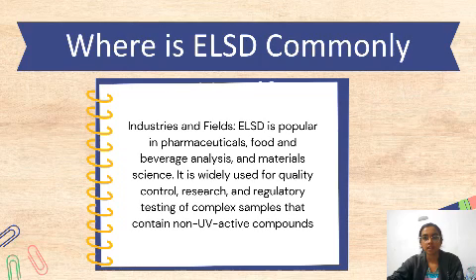Where is ELSD commonly used? Industries and fields. ELSD is popular in pharmaceuticals, food and beverage analysis, and material science. It is widely used for quality control, research and regulatory testing of complex samples that contain non-UV active compounds.